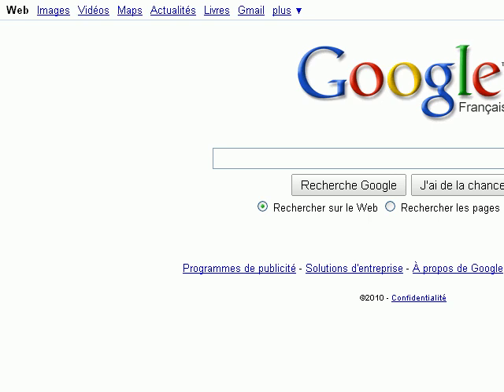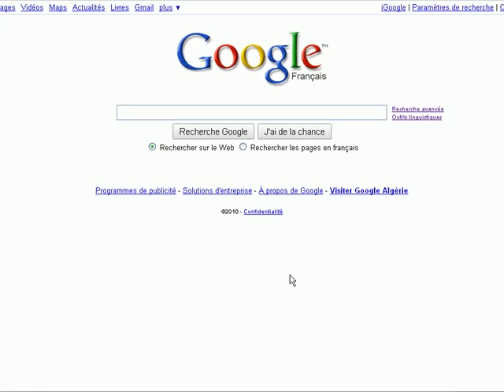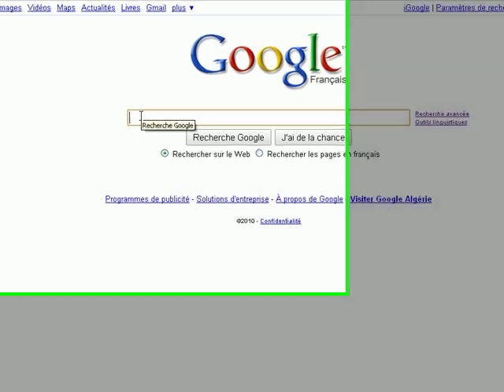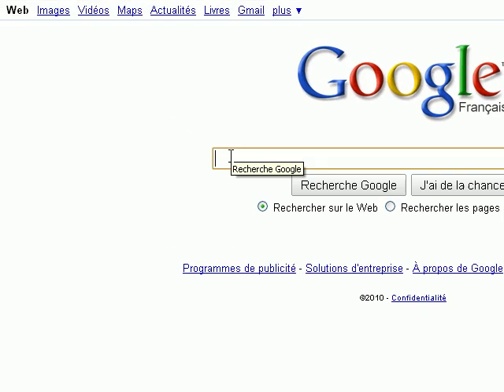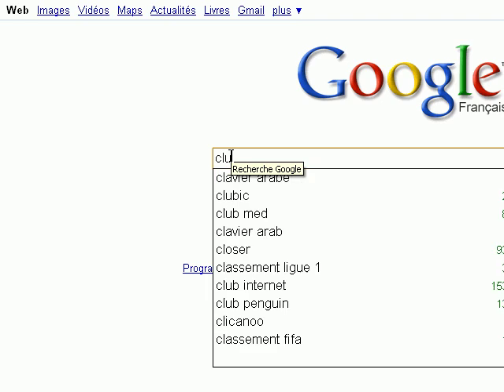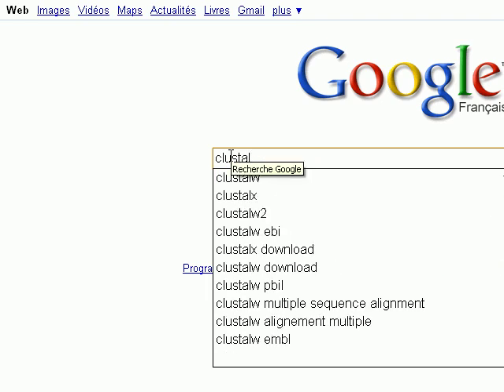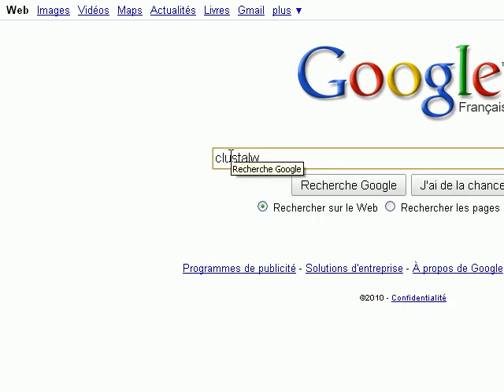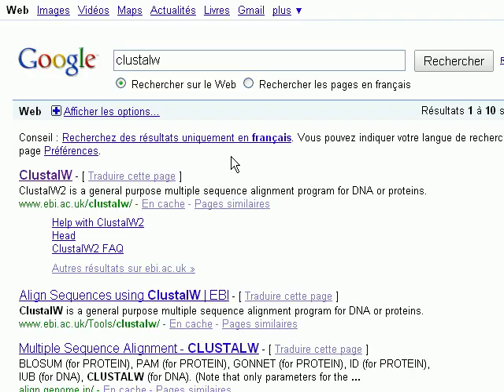In this tutorial we're going to use the program called ClustalW, which can do a multiple sequence alignment. We go to Google, write ClustalW, and we hit enter. We're going to use the ClustalW program located on the EBI server.